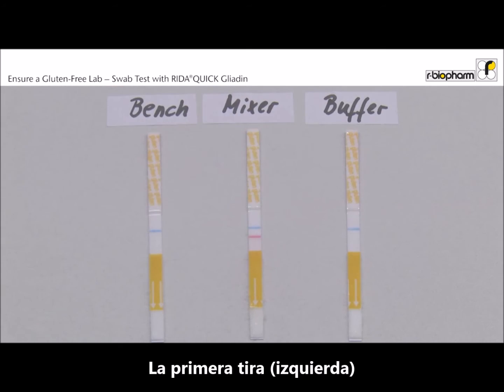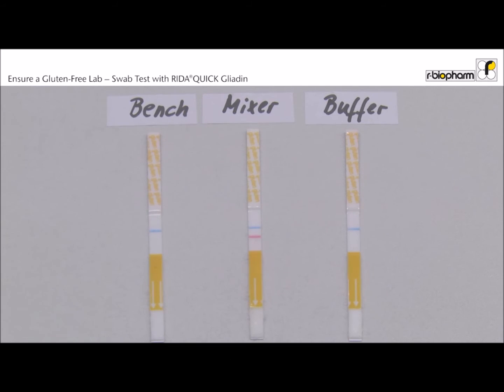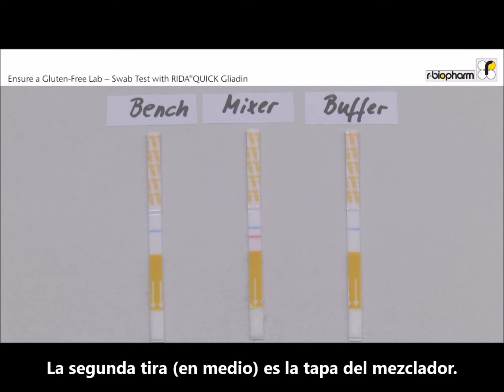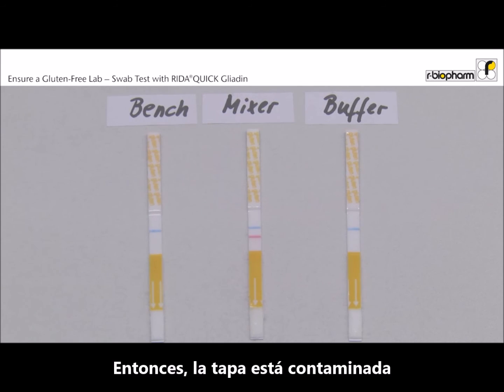The first dipstick is the swab from the lab bench. Only the blue control band is visible — this result is clearly negative. The second dipstick is the swab from the lid of the mixer. It showed the blue control band and the red test band. The result is positive, so the lid is contaminated and needs additional cleaning.